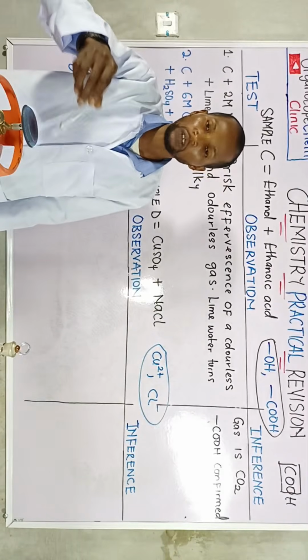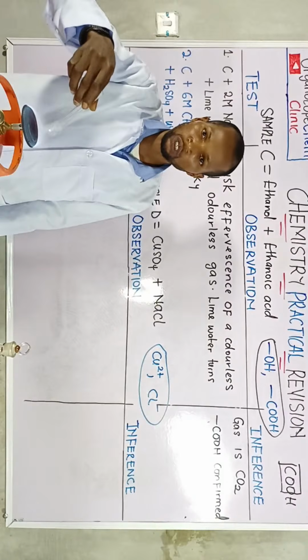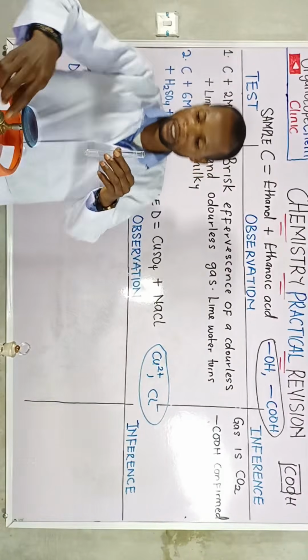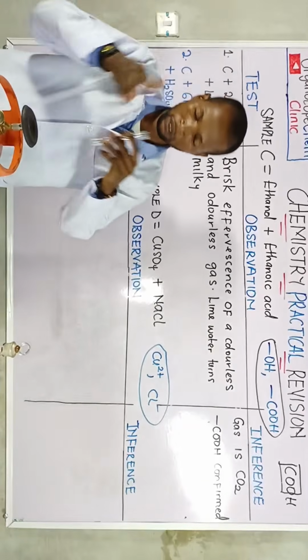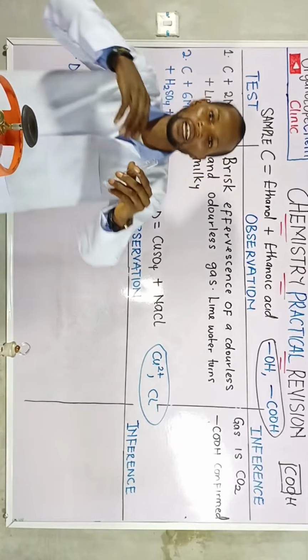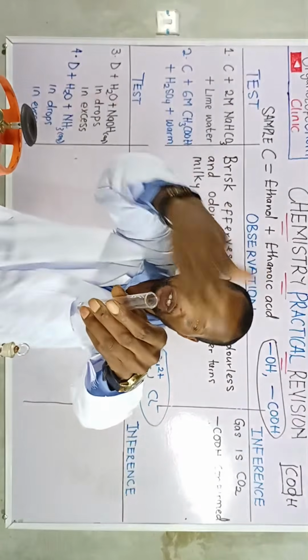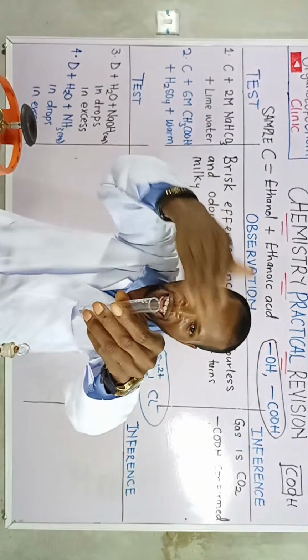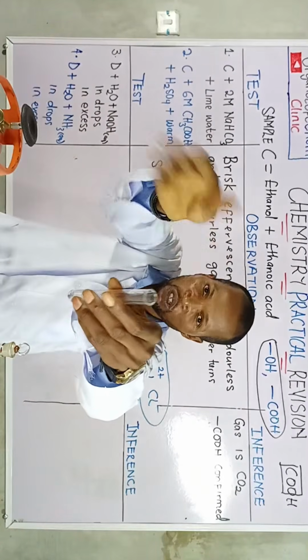Before we proceed, this is how to heat. You move it around. Okay, you have to warm, not to boil. All right. Can I turn off the heat source? I want to believe, assuming you are here, you should be able to perceive the sweet aroma. This is how to blow air to your nose. Okay, don't dip it into your nose. This is how to do it.